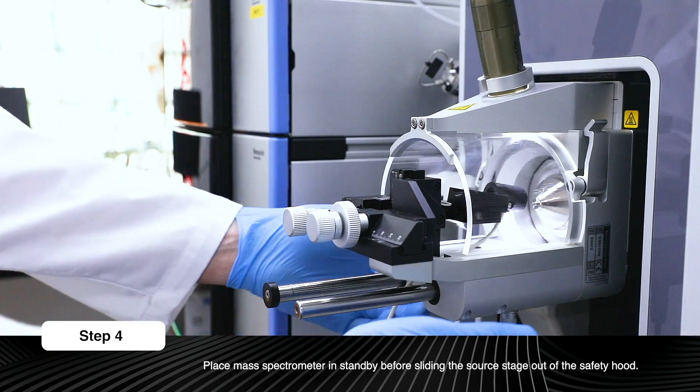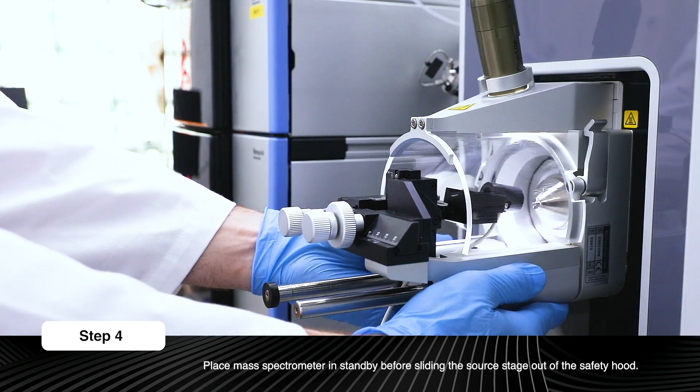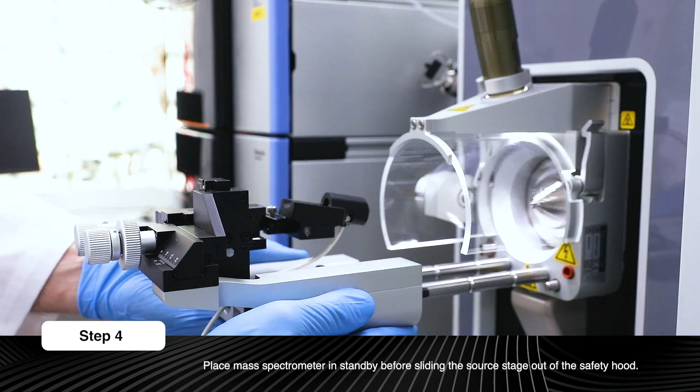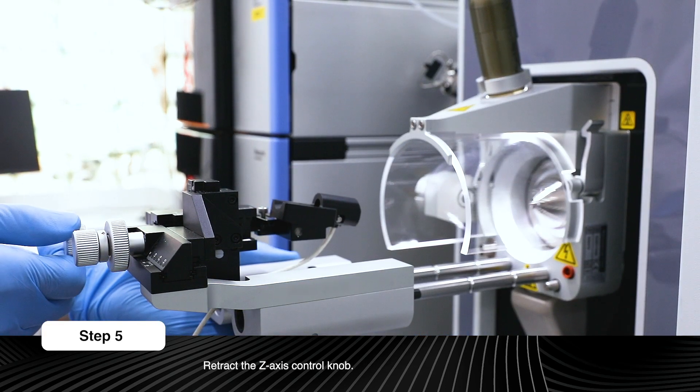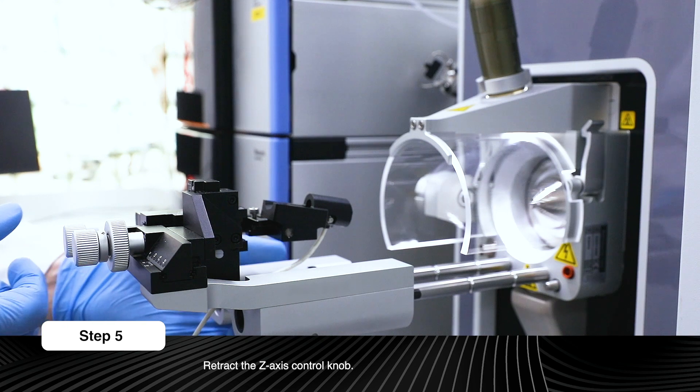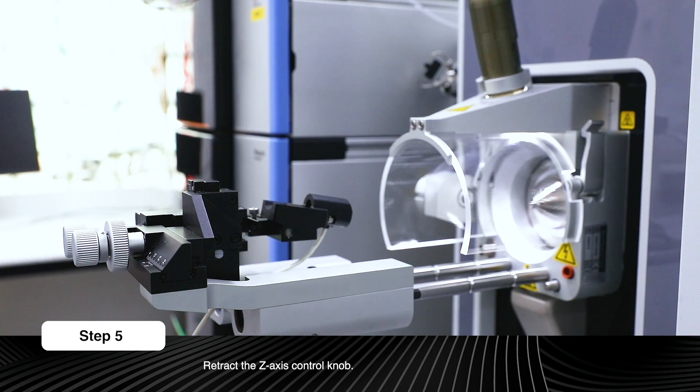Place the mass spectrometer in standby before sliding the source stage out of the safety hood. Retract the Z-axis control knob to prevent the emitter contacting the ion transfer tube when the column is inserted and the source stage slides into the operating position.